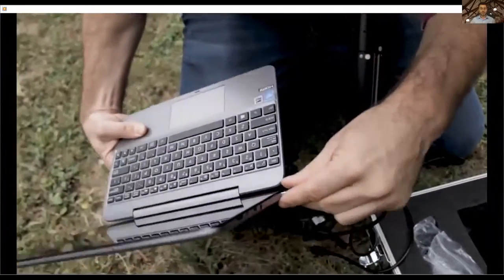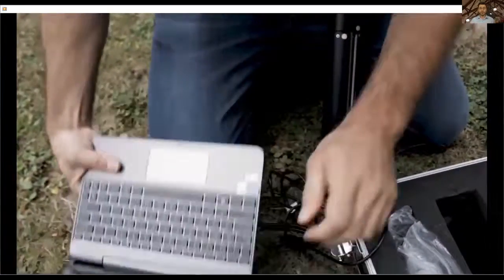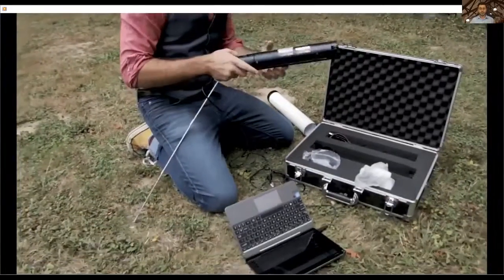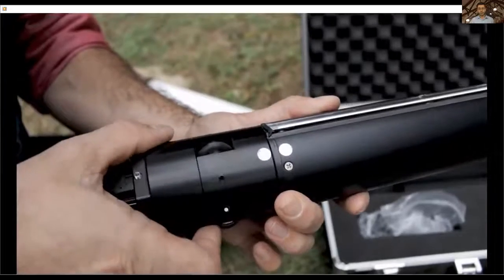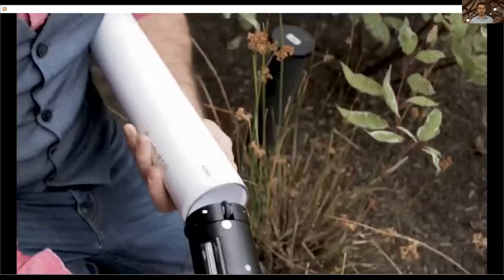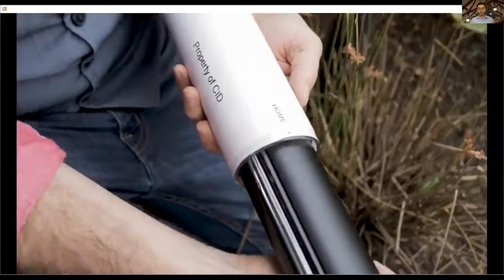And then it's pretty simple. This is actually the laptop right now that we are providing with the CI600. And it's fairly plug and play. Once you do a calibration, this is the home position. You stick it into the calibration tube.